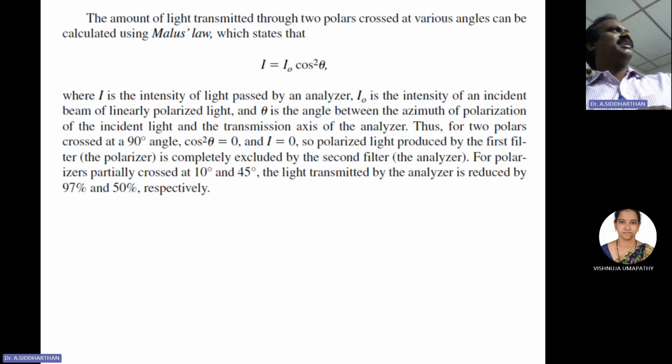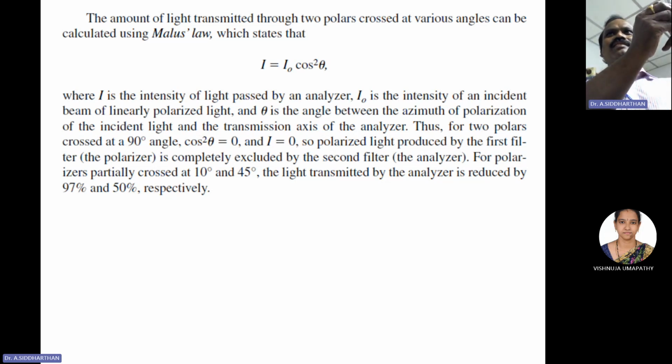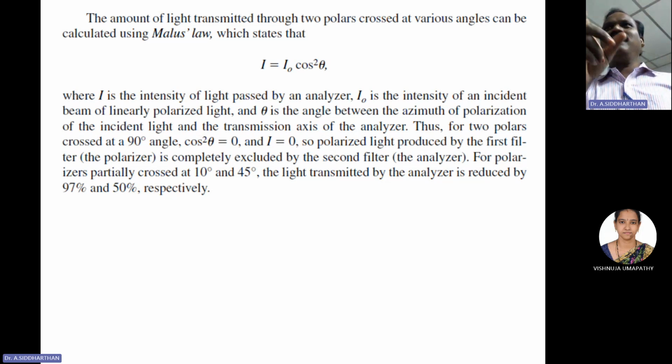Suppose this is the polarized light entering your door, it goes through. Then I make this rotation, then I make this rotation. One half it is not there, another half it is there. Twice I have a maximum in the rotation: dichroism.